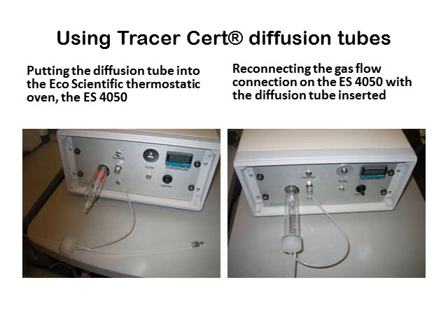Periodically weigh the tube over a period of hours, days or weeks in order to collect sufficient weight loss data versus time to estimate the diffusion rate of the vapour out of the tube, using linear regression analysis. If you would prefer, via our distributor Eco Scientific, you can have the diffusion tubes which you purchase calibrated for a standard fee per tube by Tracer Measurement Systems Limited.